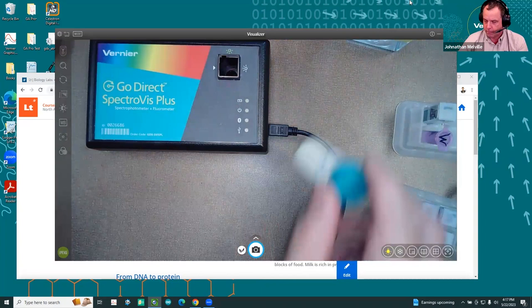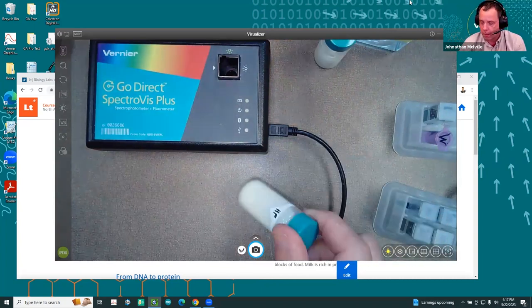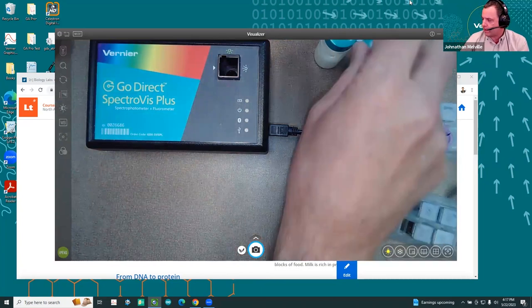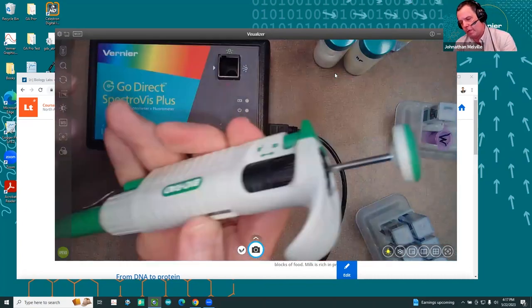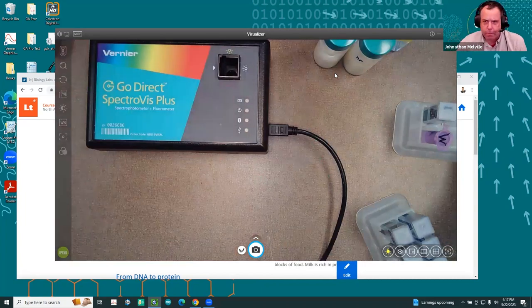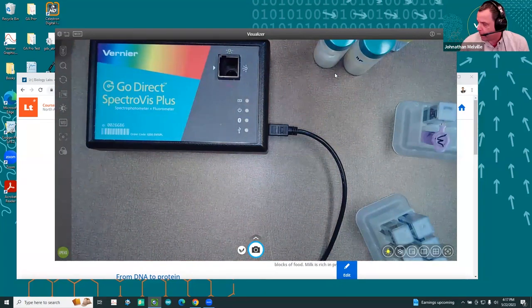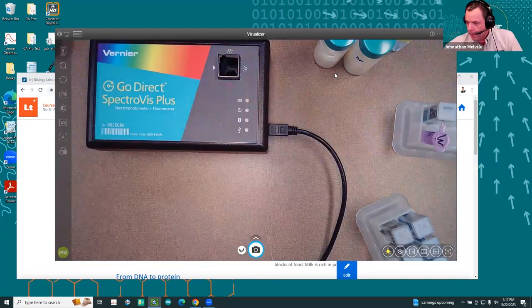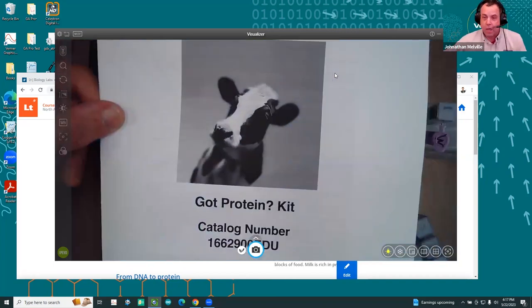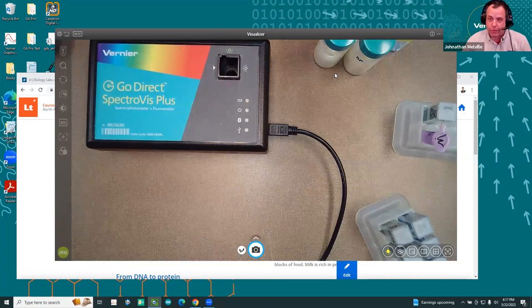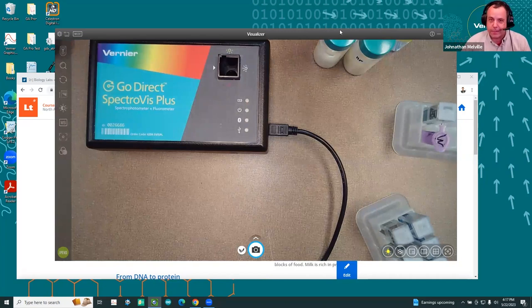So can everyone hear me? Great. One of the great things about this kit — I've got a little spectrometer here. The kit comes with a pack of 100 cuvettes and caps. Here's some Coomassie stain — the Coomassie stain right here — the buffer mixed into a 1x buffer solution. It also comes with clearly labeled standards for making the standard curve. I've marked the ones I've opened with an X. It's incredibly simple to prep: I have non-fat milk and a high-protein drink bought at the store for about two dollars each. You also need a P1000 and P200-220 micropipette and tips.